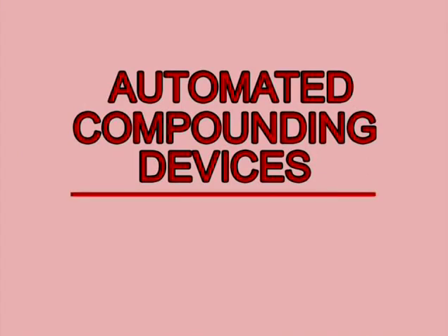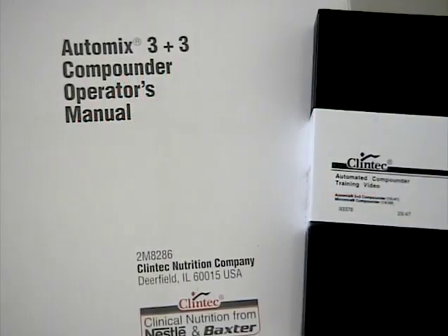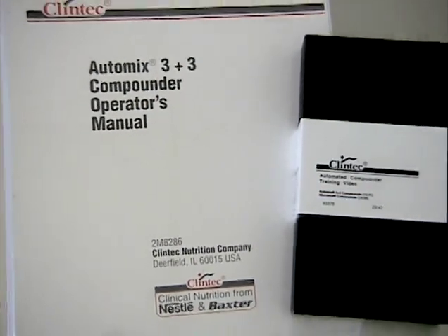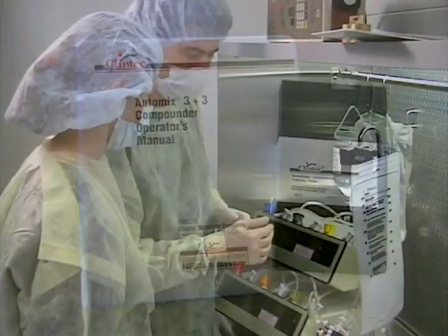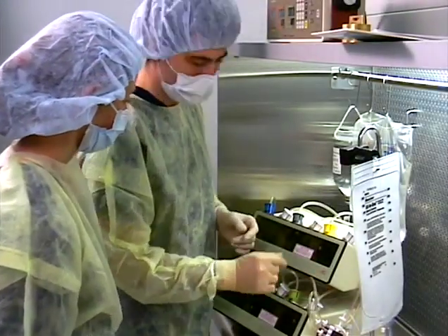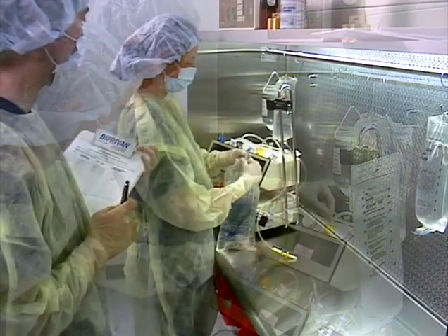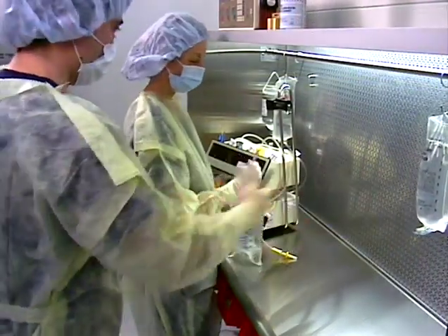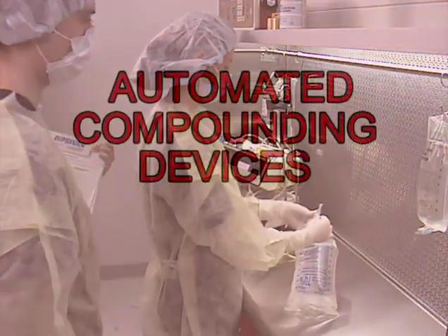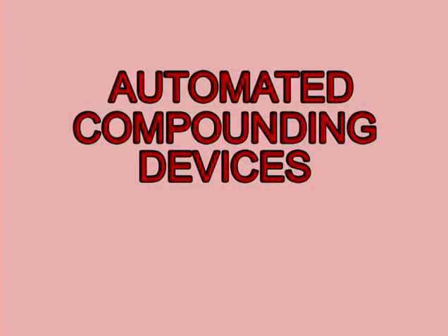Automated compounding devices. There are several types of compounders in use. The following presentation is an example of one type of compounder. The official operator's manual for the specific compounder should be studied, along with any training literature and films supplied, and a test of proficiency with your specific compounder should be successfully completed prior to using the device.